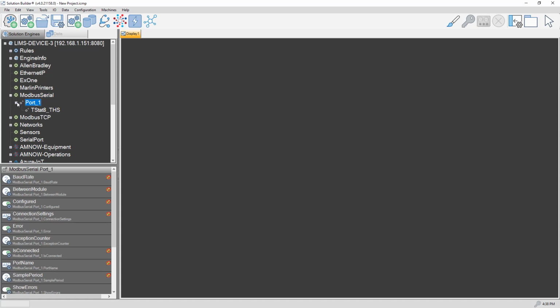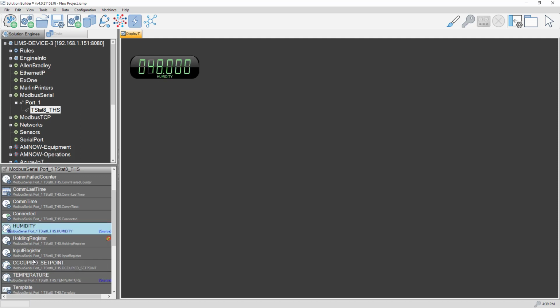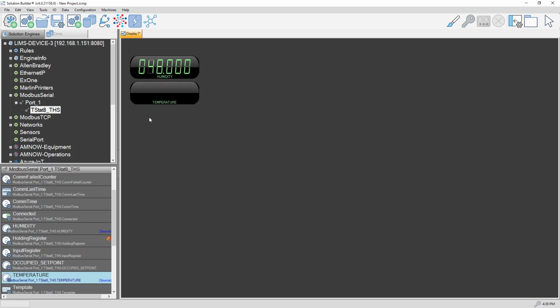Again, those devices are listed in this tree to the left-hand side, and your job, via your basic computer skills, is to open up the tree, look at the device that you're interested in, and go ahead and get the information out of that device. So let's look at the humidity, which is listed down here as data associated with that particular device, and then we'll take the humidity and make a numeric value out of it. Scroll down a little bit, and we see that it also has temperature. So I'm going to go ahead and list that temperature right underneath there. So there are two pieces of data that are interesting. In that tree, we will collect all of the information that's interesting.